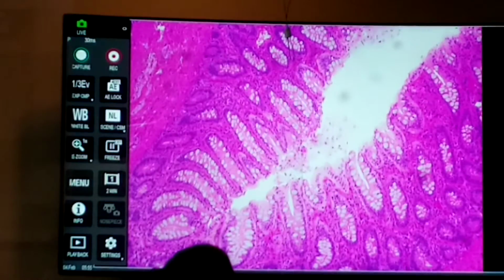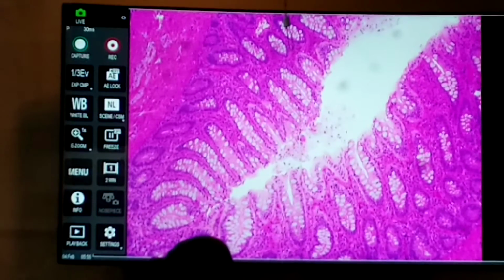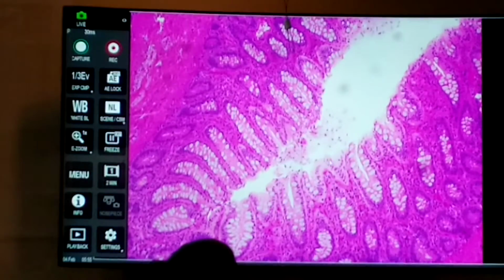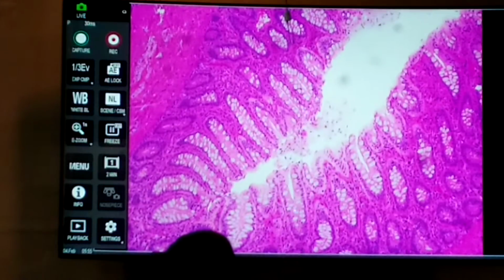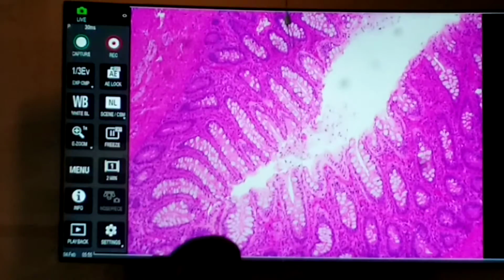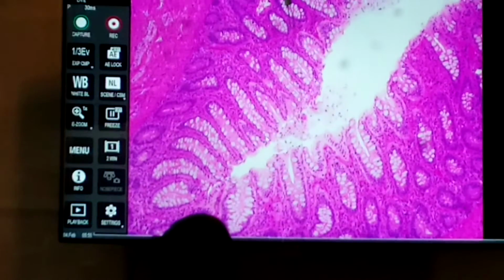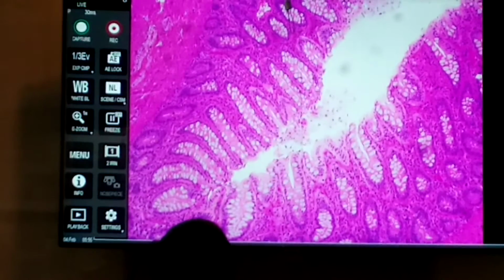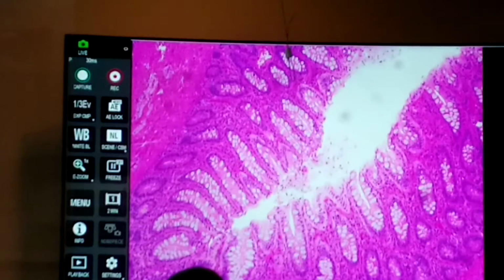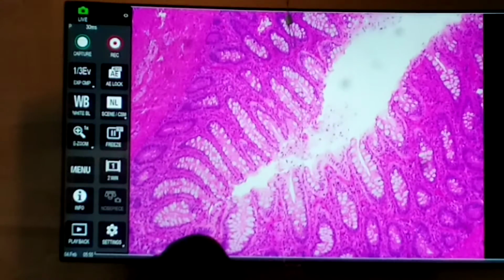So here is the lumen here, and it's lined by what type of cells are these? What type of epithelium? Hold on. What do you think these are that extend down, that invaginate down? Goblet cells. Oh, you have a lot of goblet cells, but what are the structures? Not the cells, but what are the structures that extend down? Like this. In other words, the epithelium lines the surface, and then some of these epithelial cells invaginate down like this. What are these structures that invaginate down?